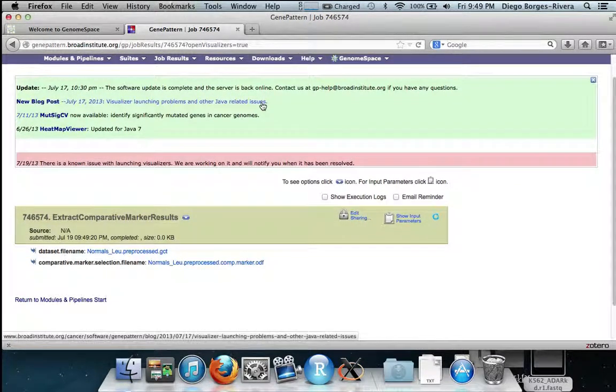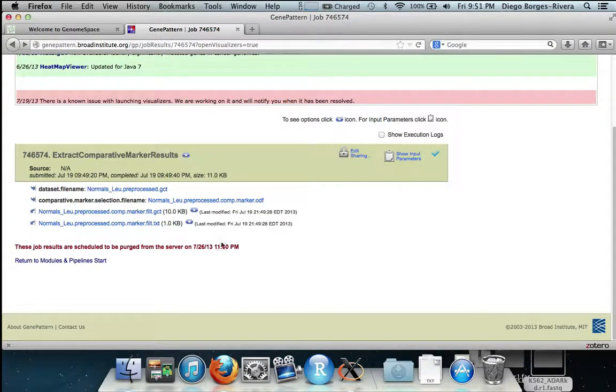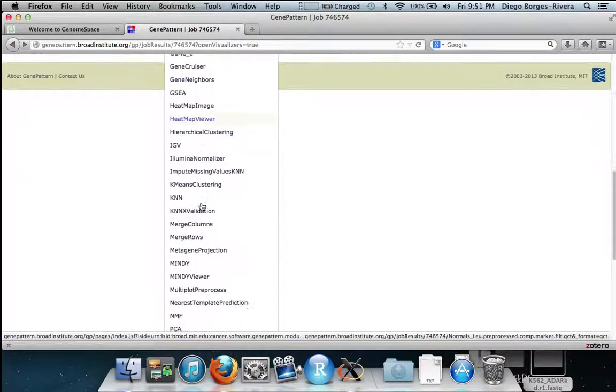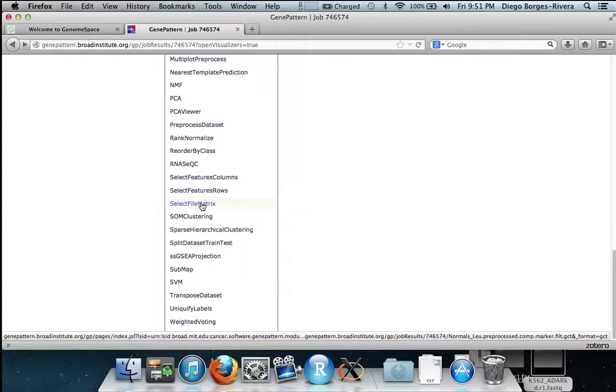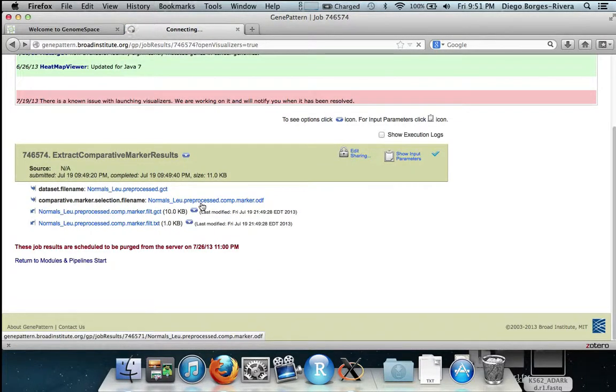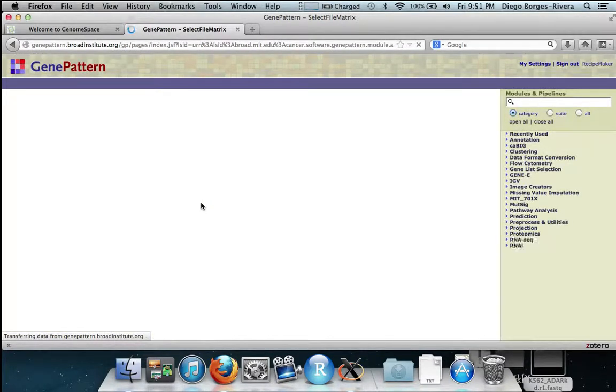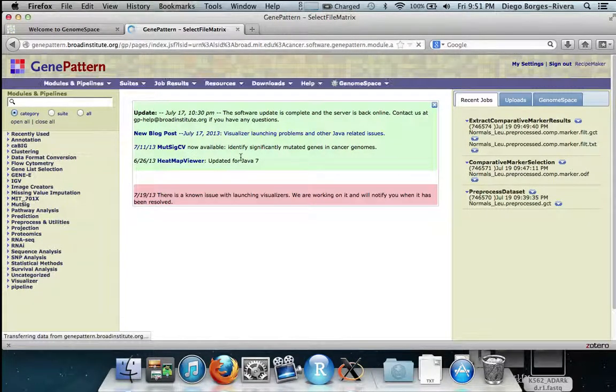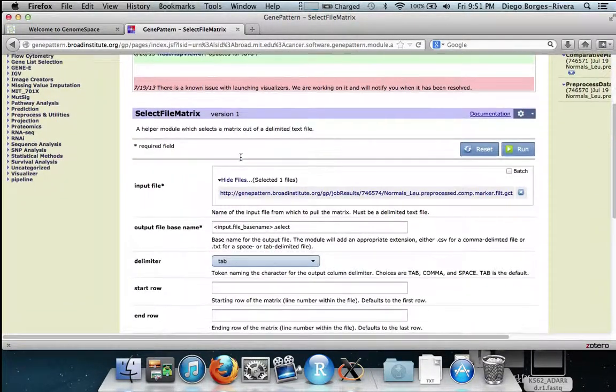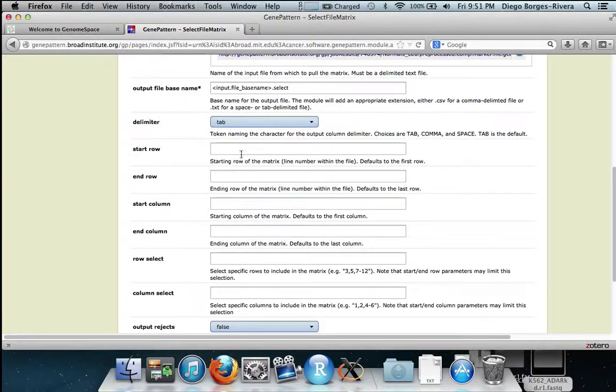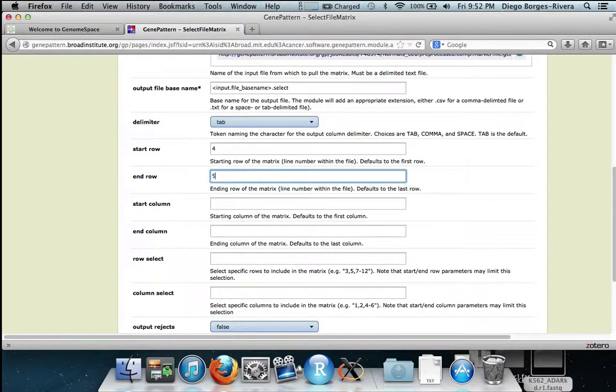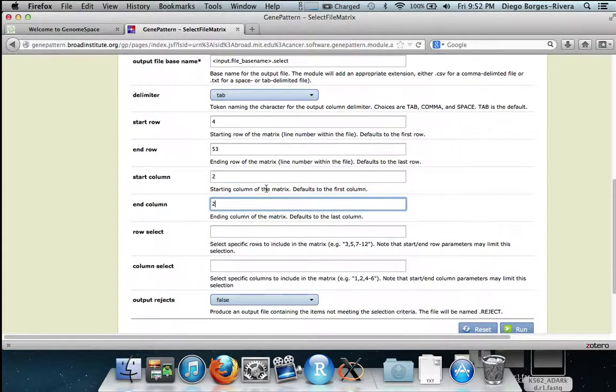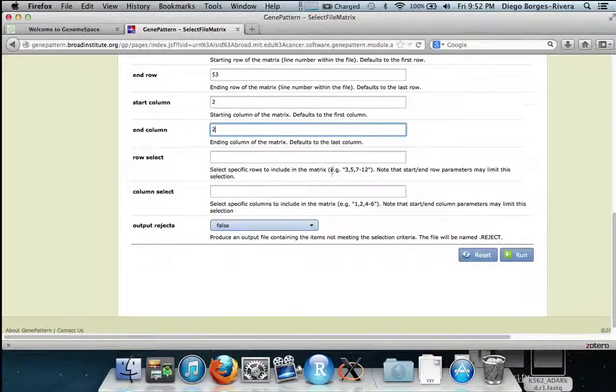This will produce a filtered expression file which we now need to select the gene names from. We do this by sending this file to select file matrix. In select file matrix we set the following parameters: The first one is start row setting it to 4, end row to 53, start column to 2, and end column to 2. We then hit run.